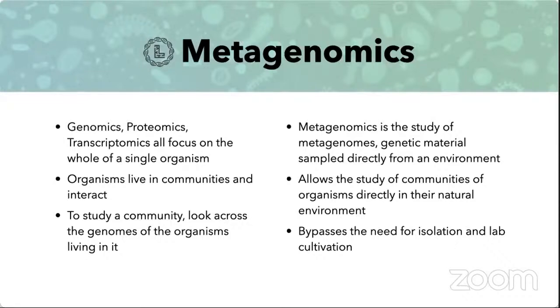So the term metagenomics covers all of these studies and refers to both the research technique and the research field. The field can be defined as the genomic analysis of microbial DNA from these environmental communities that we discussed, and the tools used enable us to make population analyses of previously unknown, unculturable, or uncharacterized microbes or bacteria in general. This is very important in the current scenario because only around 1 to 2% of bacteria can be cultured, grown, and studied in the laboratory.